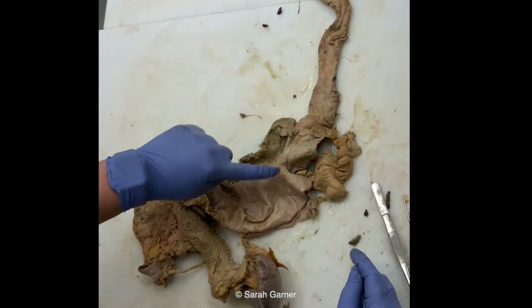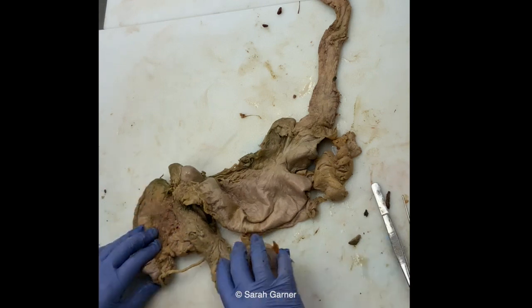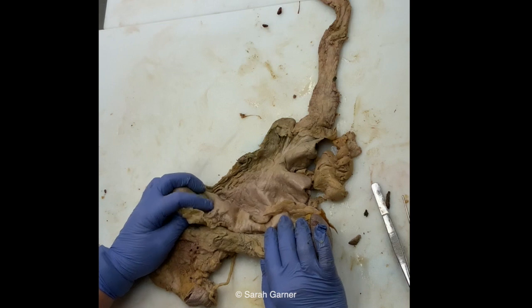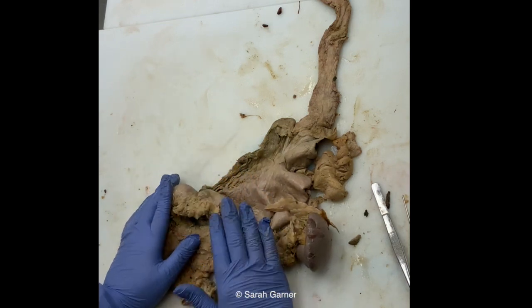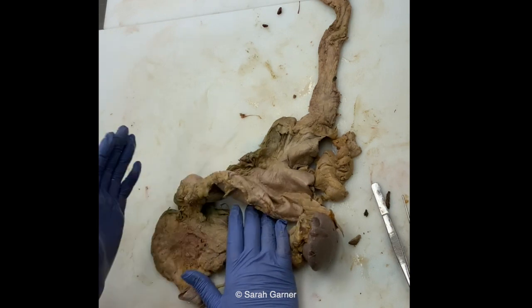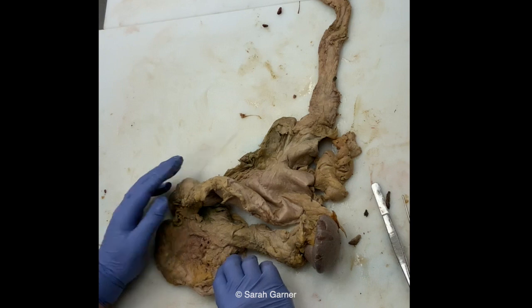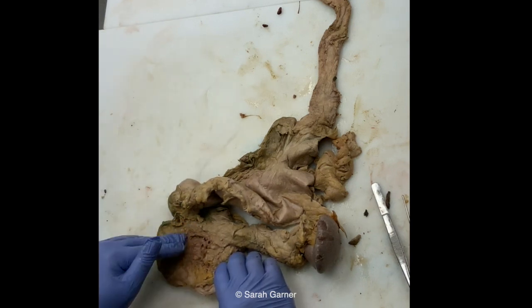So now what we have left here, this would be like if it was in anatomic position. We have esophagus, stomach, duodenum, pancreas, spleen, right? So here, what I always tell residents, PA students, everybody who's first learning this, is take this opportunity to practice your Whipple sections, because that Whipple section, the one straight through the ampulla, is really important, and it's kind of a more challenging section to get. So while you have the opportunity, take it and do it.